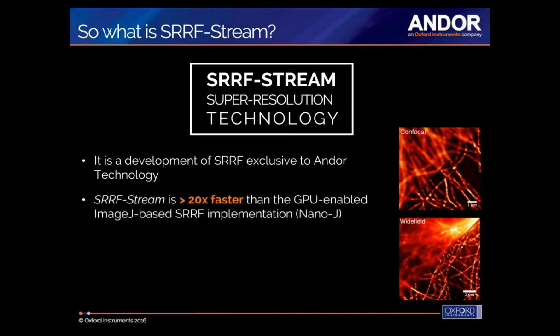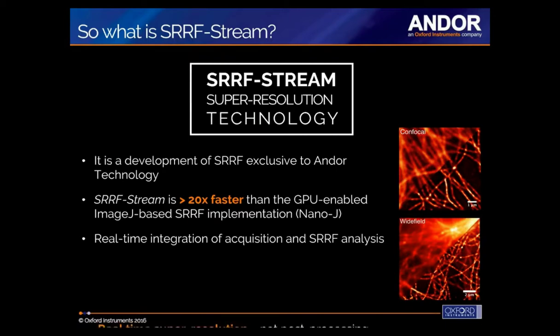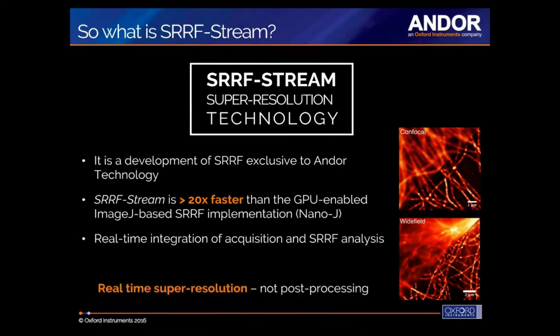So what we did then is that we were able to optimize the GPU operations and greatly enhance the speed of SRRF. And what that allows is for actually real-time integration of the acquisition events and the SRRF analysis. And that provides real-time super resolution, so it is not just the normal post-processing of the normal SRRF.